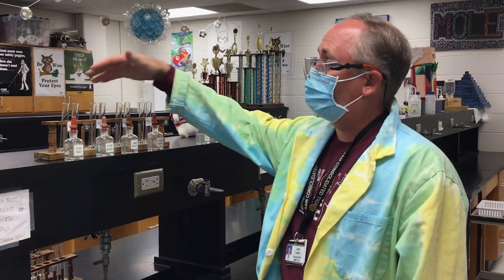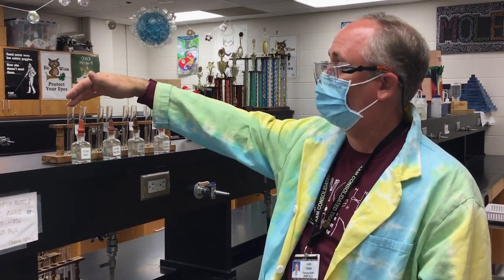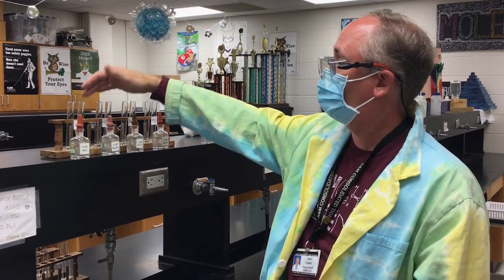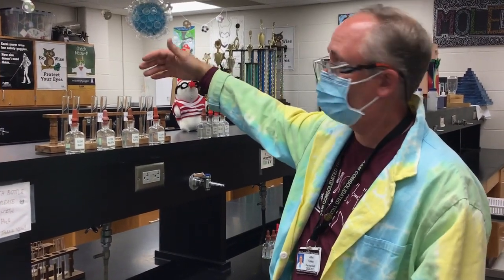Okay, so anion cation lab, this is for unknown A4. So these are people whose first letter of their last name starts with S all the way to Z. So what we've got here are pairs of test tubes. The first test tube in each pair is going to be your known, and the second of each pair is going to be your unknown. So in each of these second ones, I have the compound that's in A4 in each one of them.